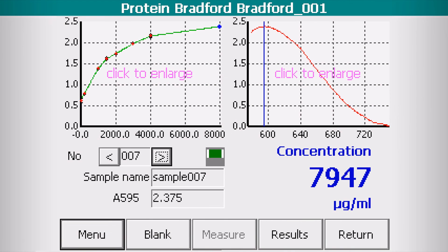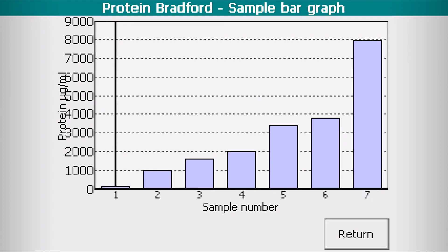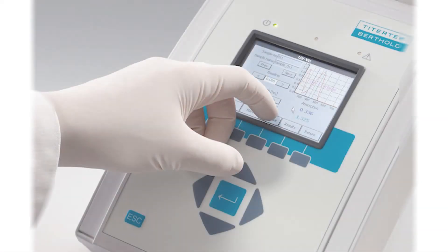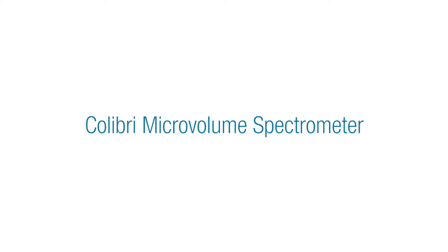Continue measuring your samples. When you are finished, click Results to see the results table. You may also view your results as a bar graph. Thank you for your interest in the Colibri Microvolume Spectrometer.